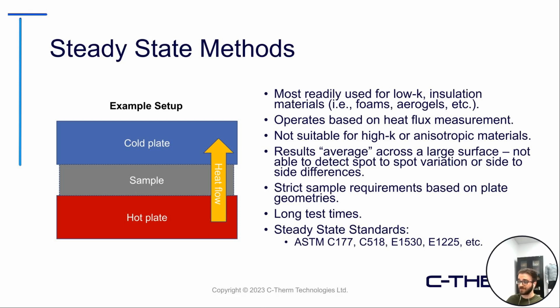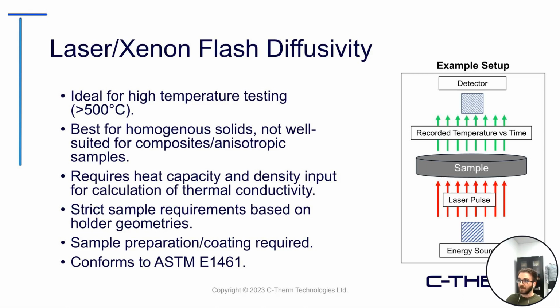The other thing with steady state, I'd say the biggest drawback is while they are very good at what they do, they generally carry quite long test times. So you're talking minutes to hours, depending on the type of profile that you're setting up and running. However, they do conform to some very well-known standards, such as ASTM C177, ASTM C518, and so forth.